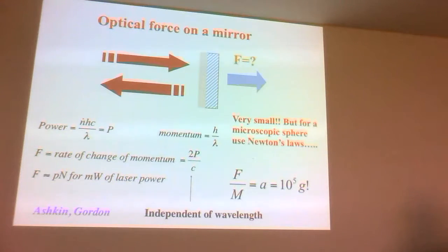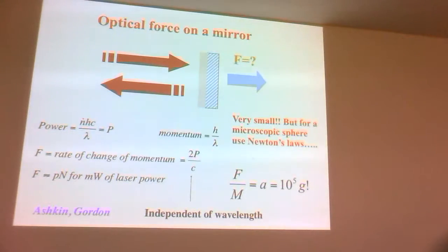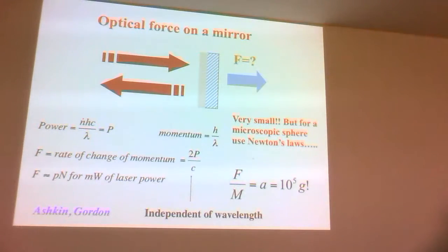How big is a piconewton? It's equivalent to the gravitational force of attraction between you and your tablet or laptop. It's not something you're going to worry about. But I'm going to worry about it, and I'm going to show you what we can do with it. And so people like Ashkin and Gordon in the 1960s and 70s worried about this, and they said, well, okay, I'm not going to move a mirror in my laboratory, or I'm not going to exert enough force to drag a glass of whiskey over or whatever.